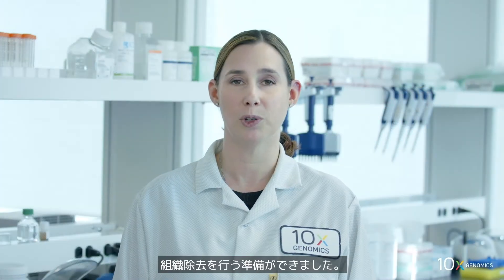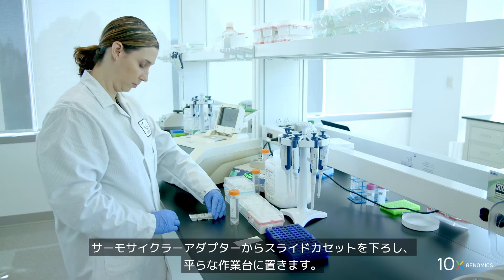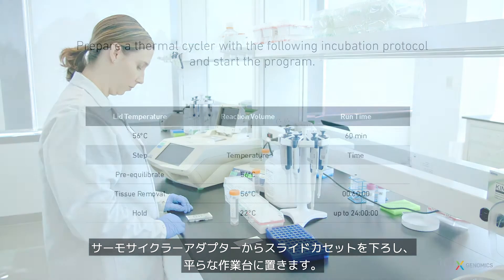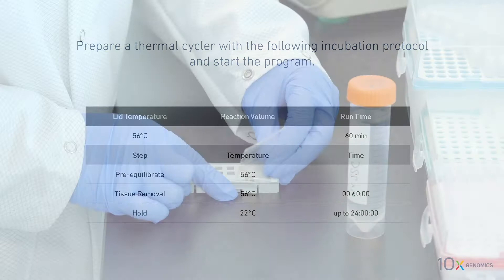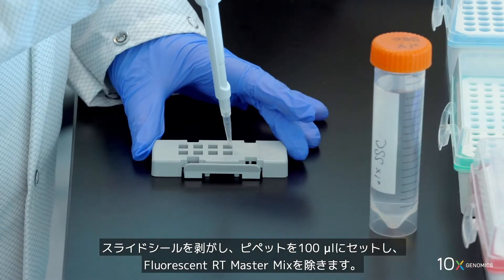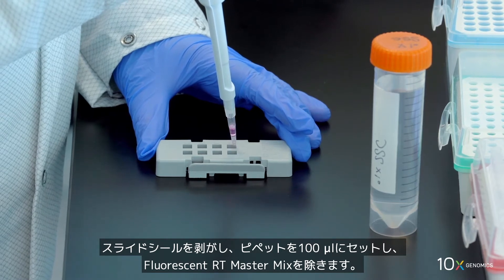We are ready to begin tissue removal. Remove the slide cassette from the thermocycler adapter and place on a flat clean work surface. Prepare a thermocycler with the following incubation protocol and start the program.